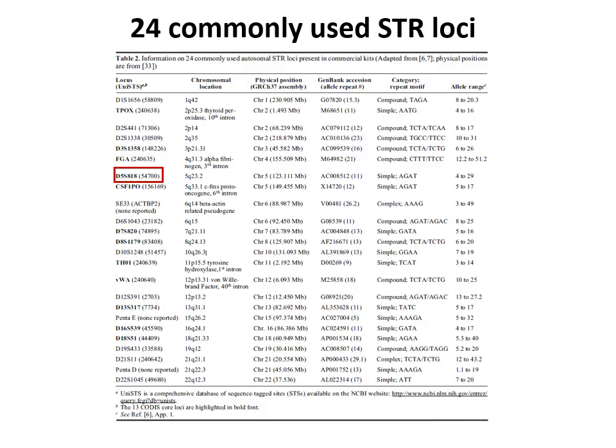In diagnostics, there are 24 commonly used STR loci. So for every locus, the exact position is given. On this slide you can see the name of the locus, the physical position of the locus in the chromosome, the sequence which is repeating in this column, and we also have the information on how many repeats we can expect in the population.